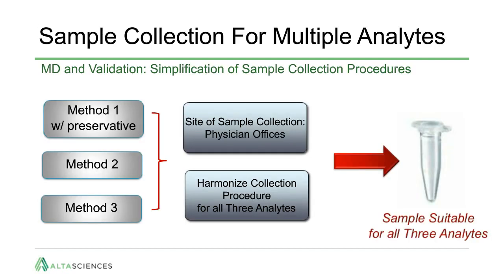In this slide, there is an example. A recent study required the collection of samples for 3 analytes. The analytes could not be combined in a single method, and to achieve timelines, method development of the analytes was ongoing concurrently. 1 analyte required preservative, and the other 2 were simple collections in K2-EDTA tubes. The study was multi-site with activities occurring in doctors' offices.